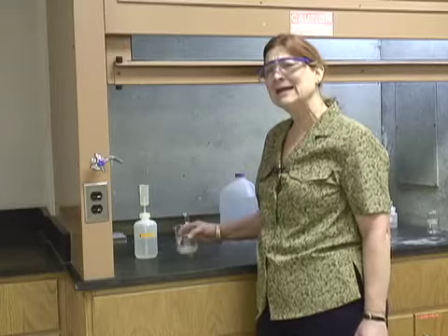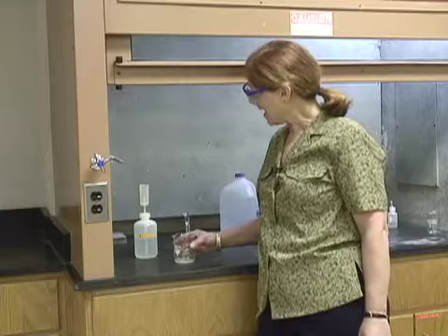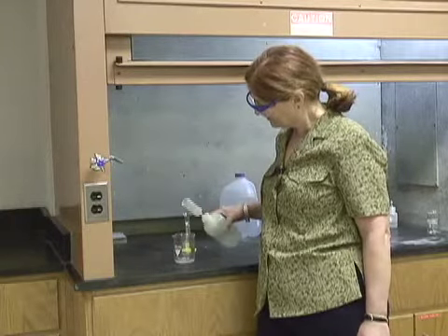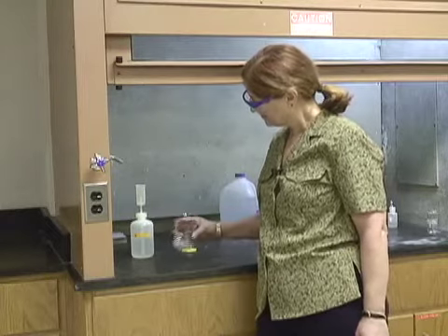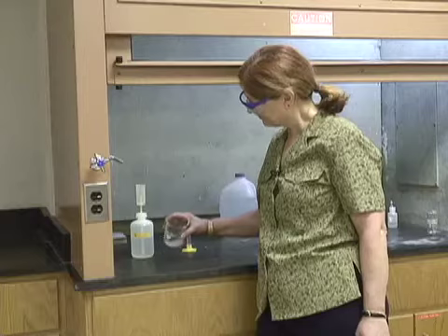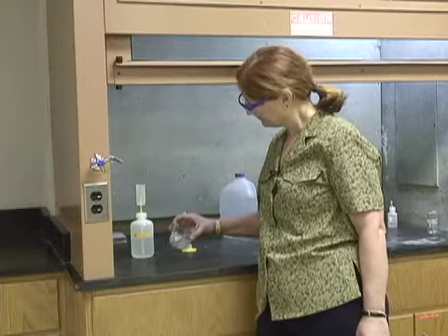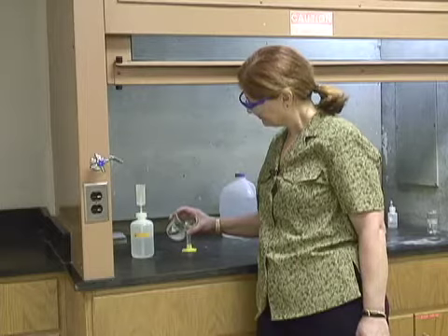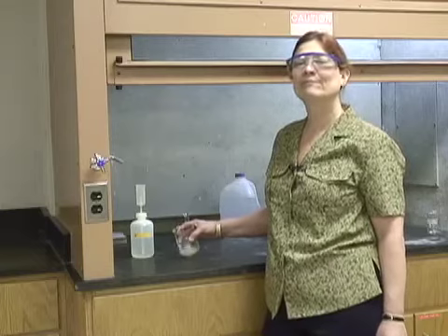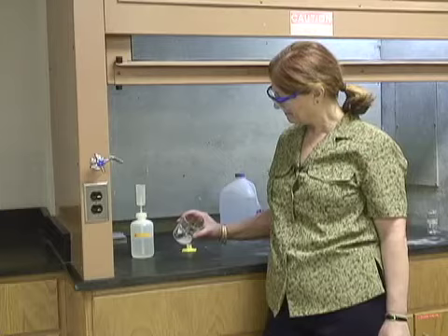I believe I had a little bit more than 10 centimeters of the magnesium. Therefore, I'm going to add a little extra of the acid, and that should do her. Particles are just floating around in there. They're just bubbling away.